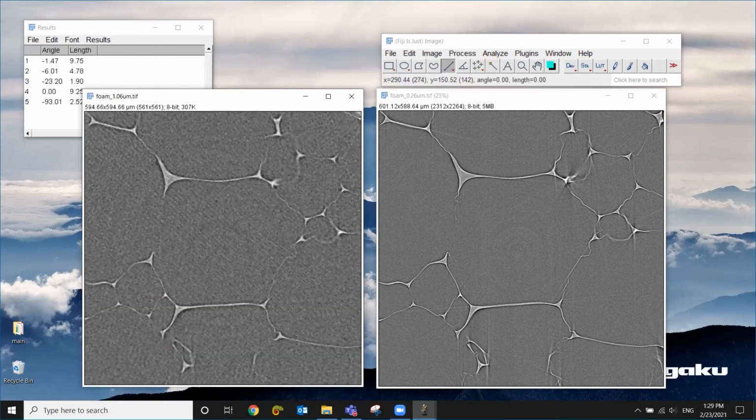But when you compare those two images, some of the lines you see here, those very fine lines, they disappear in the 1 micron resolution image. The same thing here. You can see clearly there's a line here, but this is kind of blurred and it's almost disappearing.